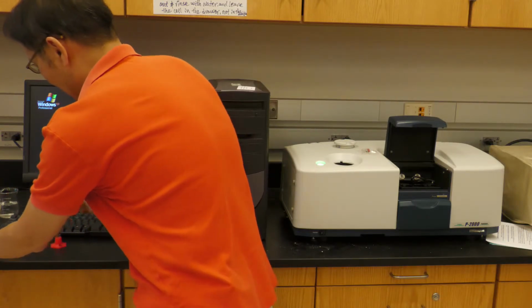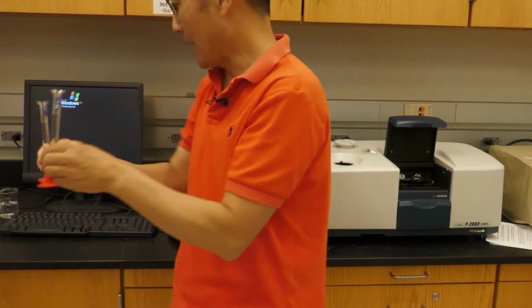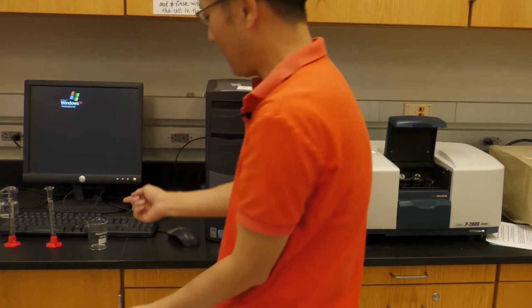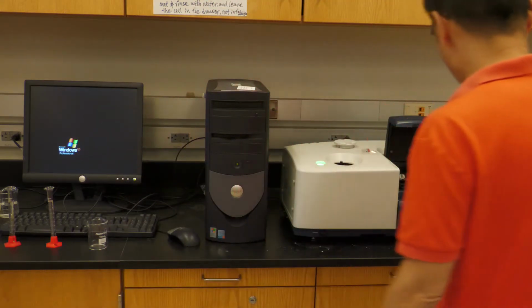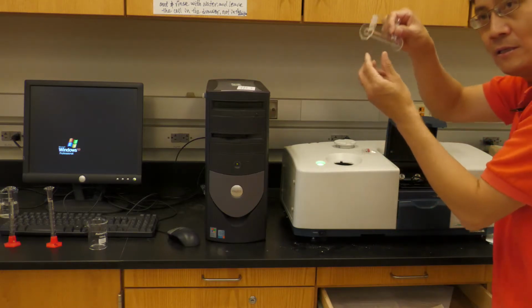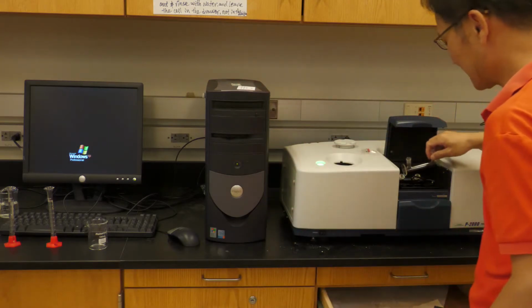Both of them are exactly 10 ml. Now I will mix this one, dump this one into this beaker and shake it. Shake it, then they start to react quickly. So after they start to react, then I dump this one into this cell. Put this cell here.